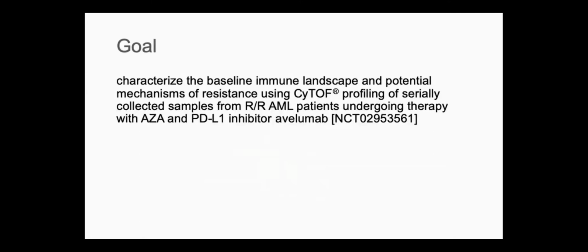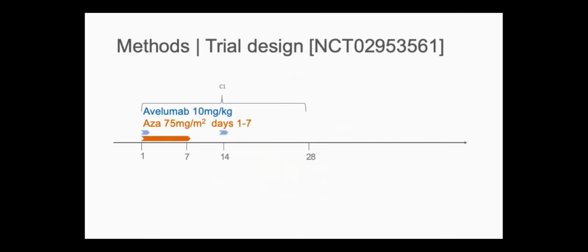But the goal with this study was really to use these samples and look at the single cell protein level to better understand the immune landscape of refractory relapse leukemias, as well as identify potential mechanisms of resistance in this setting.